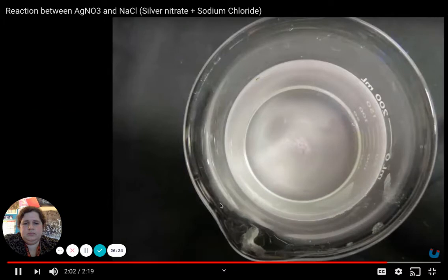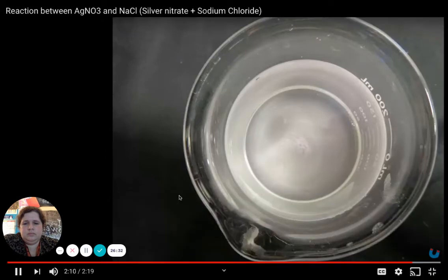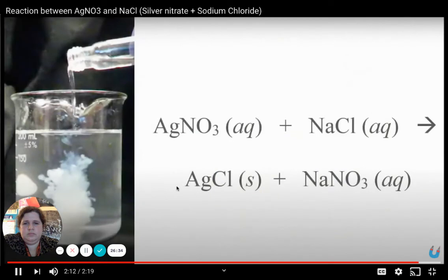If we let that liquid that we poured off evaporate, that has the Na plus and NO3, that would eventually come back to be NaNO3, sodium nitrate crystals. This is Dr. B with the chemical equation for AgNO3 plus NaCl.